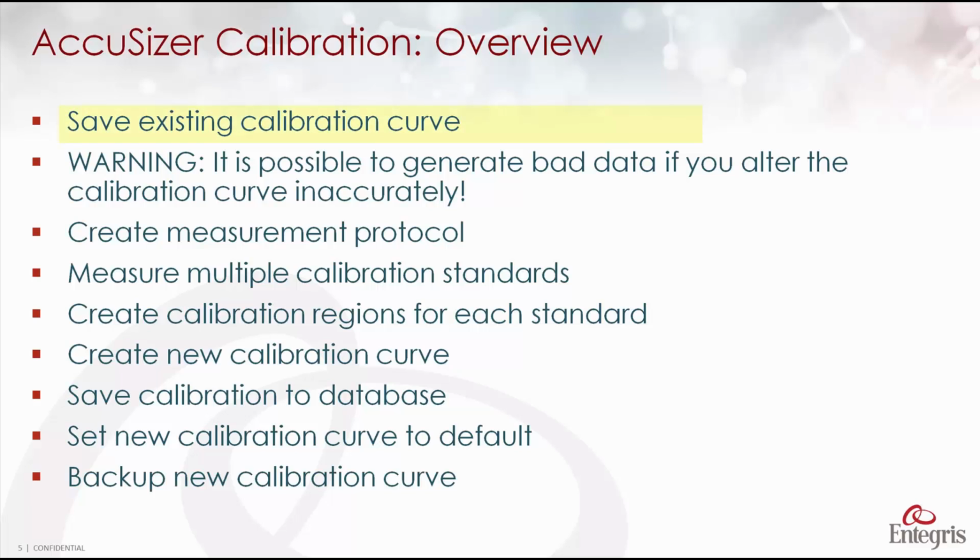First, just to be careful, we're going to save the existing calibration curve or curves. And here's a warning: if you do this wrong, you could end up messing up your calibration curves and generating bad data, so let's be careful that we do this properly.